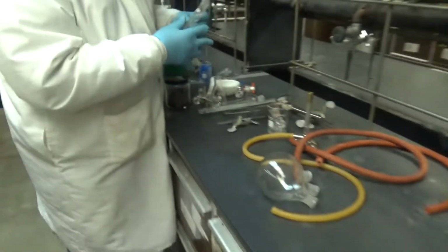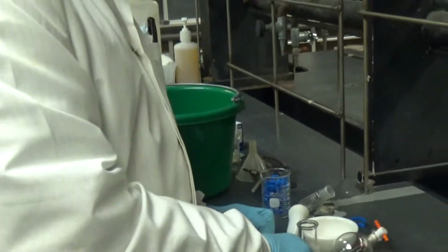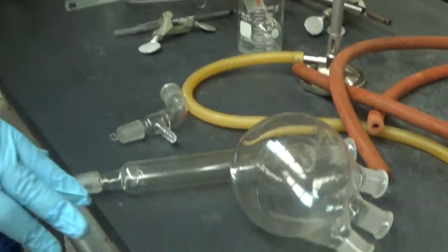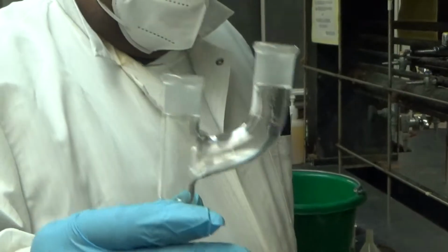We are going to use a vacuum adapter. Vacuum adapter. We are going to use a condenser. Condenser. We are going to use a Claisen head. Claisen head.